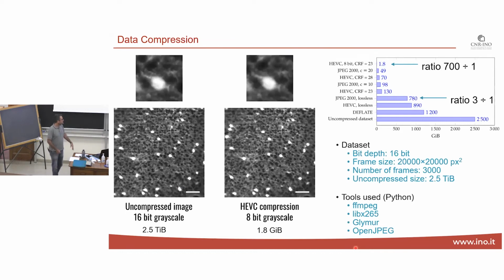Yeah, compression is a big subject, it's a big topic. We tried different algorithms. At some point, we even tried video compression algorithms, like MP4, for example, because our tomographies look like a movie in a sense, because consecutive planes are very similar. And so we thought, why not try video compression algorithms that should take advantage of the similarities of consecutive planes. It works, but it has some problems.